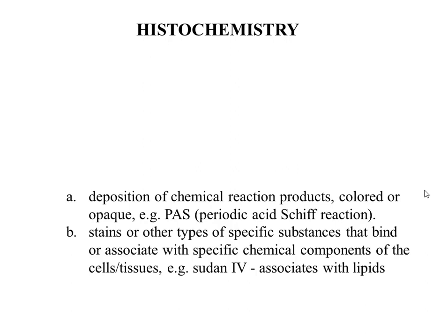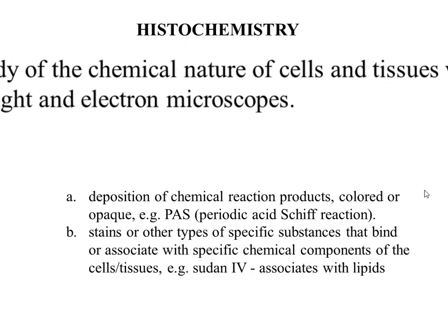Histochemistry. Histochemistry is the deposition of chemical reaction products, colored or opaque, like PAS stain or other types of specific substances that bind or associate with specific chemical components of the cells, like Sudan IV.